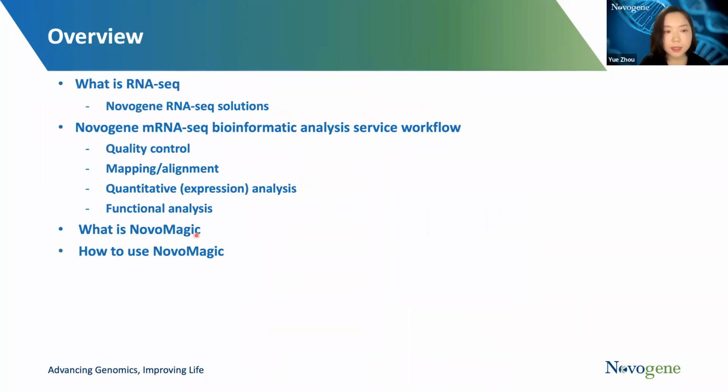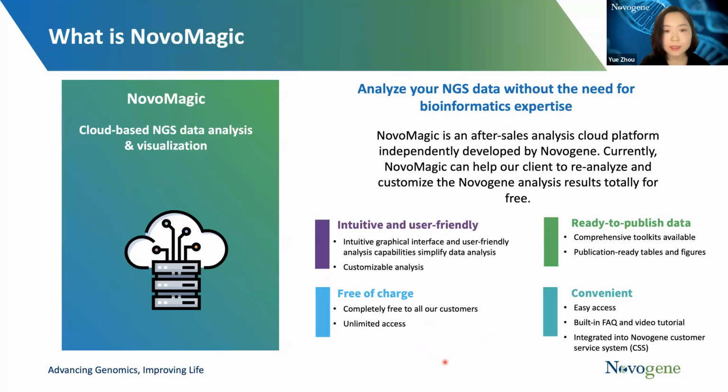And finally, we are approaching the point of talking more about NovoMagic. I have already talked about this at the beginning, but just for those who joined a bit later, a short introduction. NovoMagic is an after-sales analysis cloud platform developed by Novogene, and it can help our clients to reanalyze and customize the Novogene analysis results totally for free.